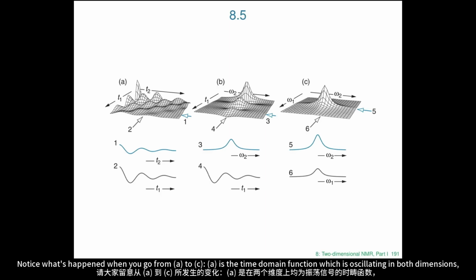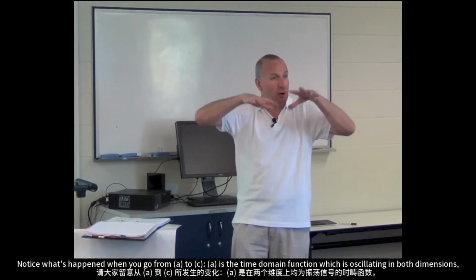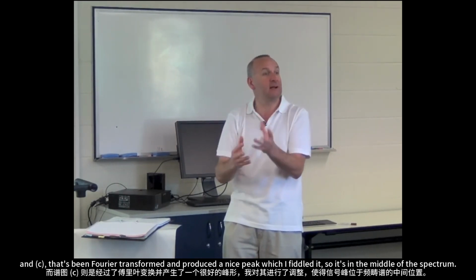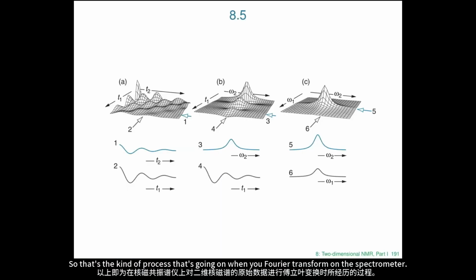And notice what's happened when you go from A to C. A is the time domain function, which is oscillating in both dimensions, and C, that's been Fourier transformed and produced a nice peak, which I fiddled so it's in the middle of the spectrum. So that's the kind of process that's going on when you Fourier transform on the spectrometer.